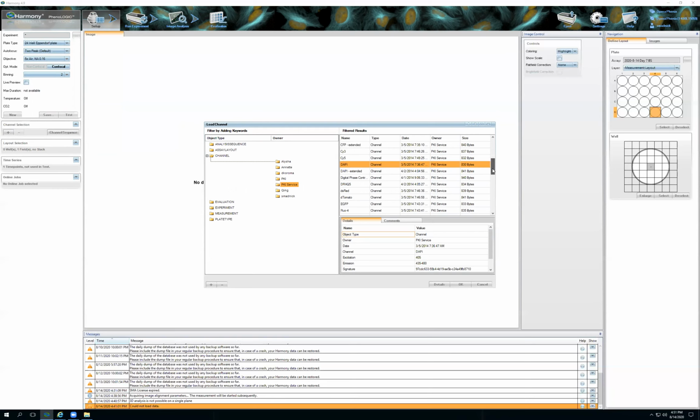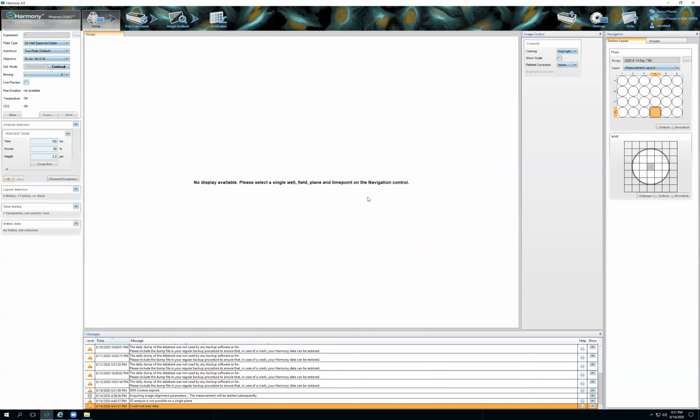I also have GFP and RFP labeled cells on this plate, but I'm going to use the Hoechst because it's going to label all of my cells, and I want to see my whole spheroid. So I'm just going to select Hoechst, and then you can leave these as the default to start with.